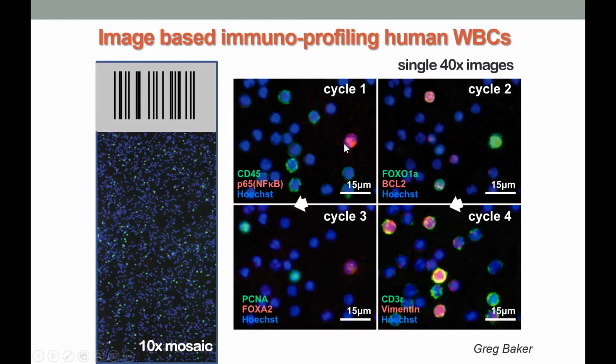Now you can use this almost like an image cytometry to study. And even more than that, we can start using some other markers that rely on the translocation of proteins between the nucleus and the cytoplasm. Here is an example of NF-κB. Unlike normal flow cytometry, you don't have the resolution to do that. In our workflow, you can actually distinguish this.